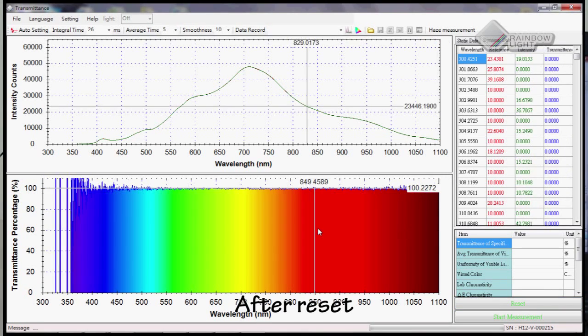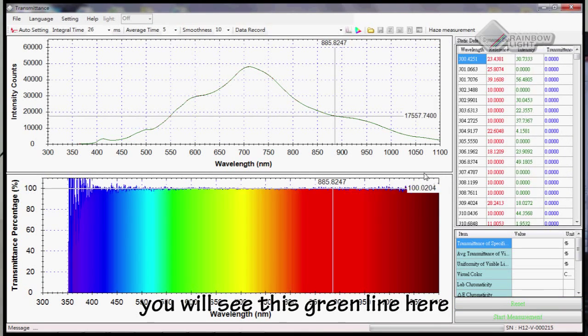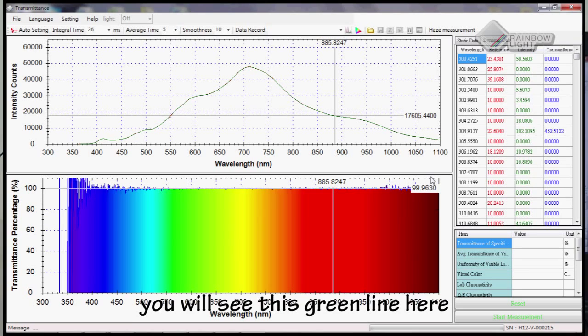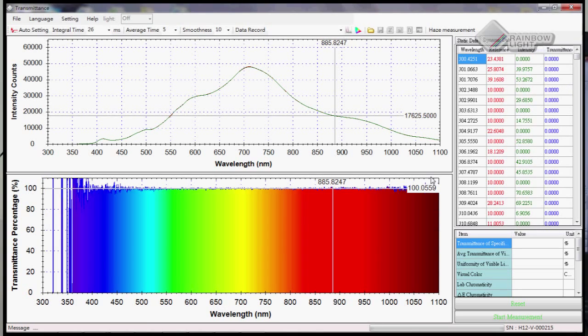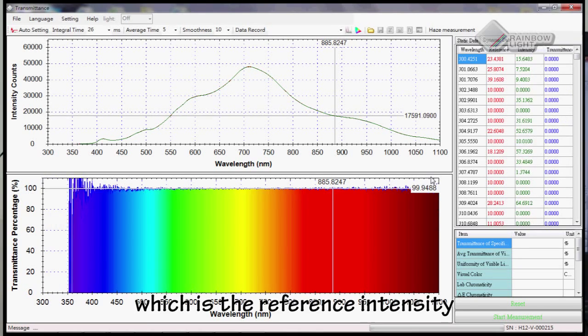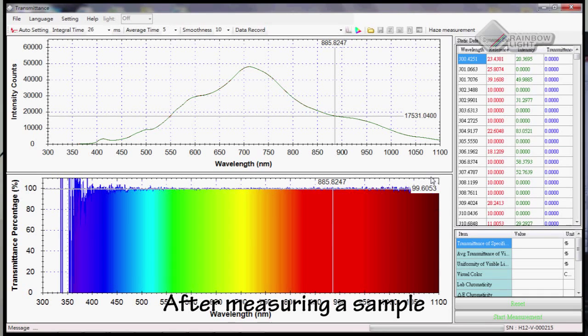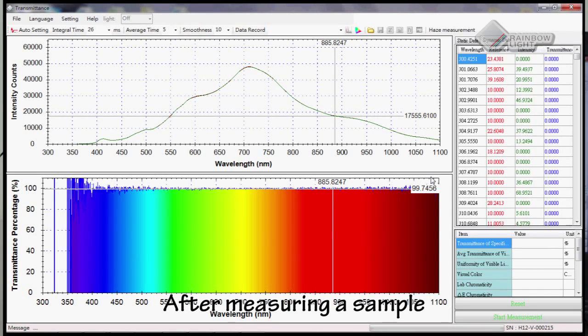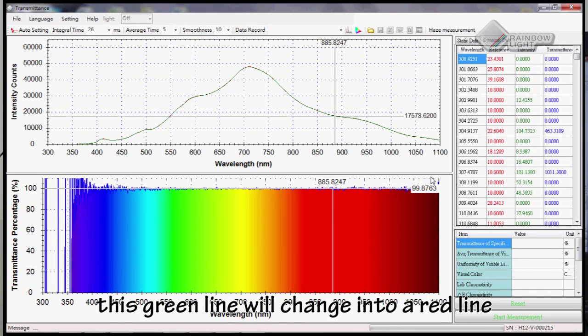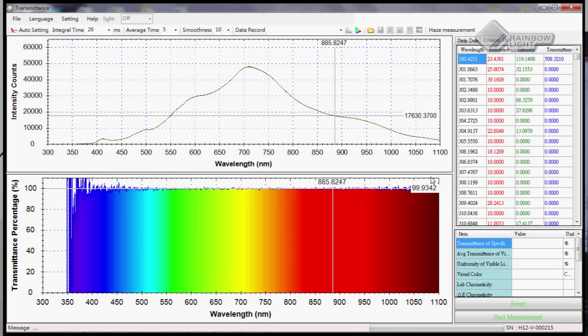After reset, we will see this green line here, which is the reference intensity. After measuring our sample, this green line will change into a red line.